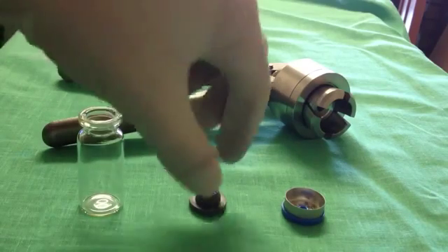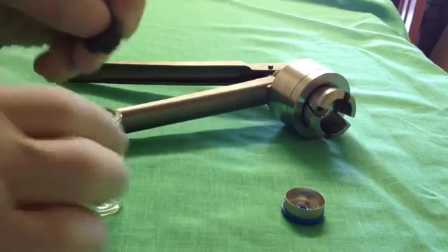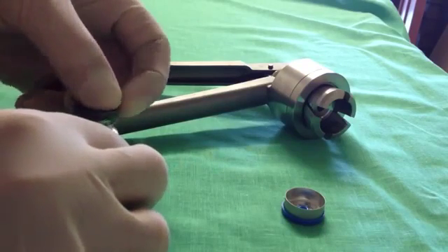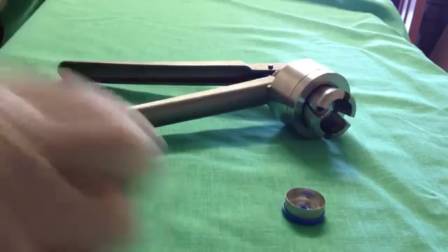You simply just need to get the rubber stop, place it over, and push it in firmly so everything is level.